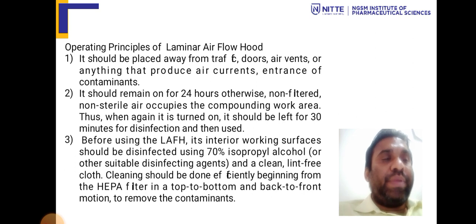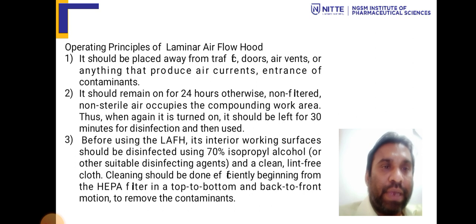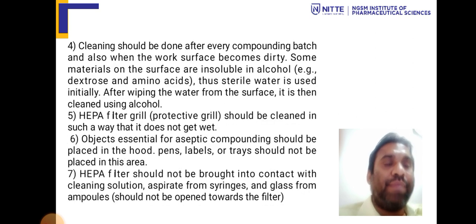Before using laminar airflow, the internal work surfaces should be disinfected with 70% isopropyl alcohol or any other disinfectant. A clean, lint-free cloth should be used, cleaning efficiently, beginning from the HEPA filter at the top to the bottom and back to front, to remove contamination.